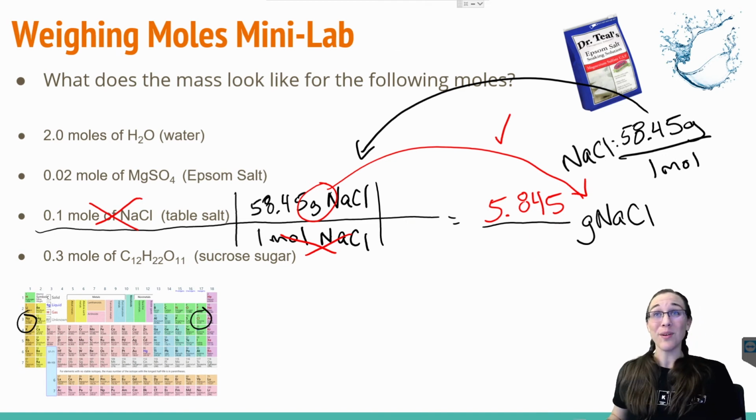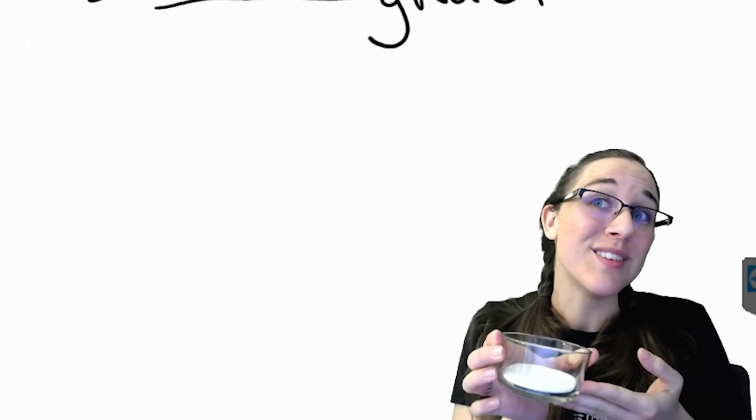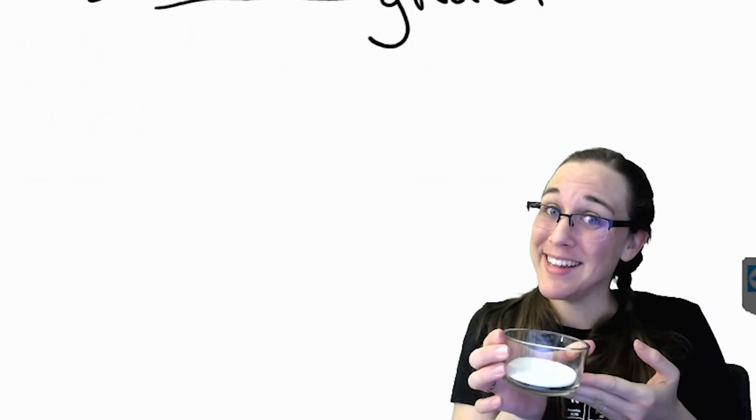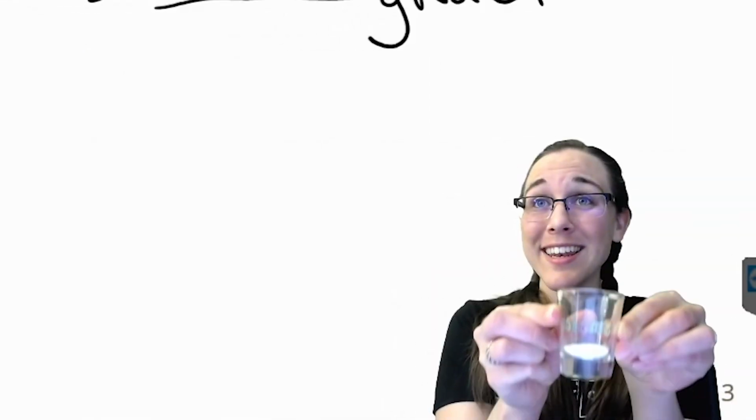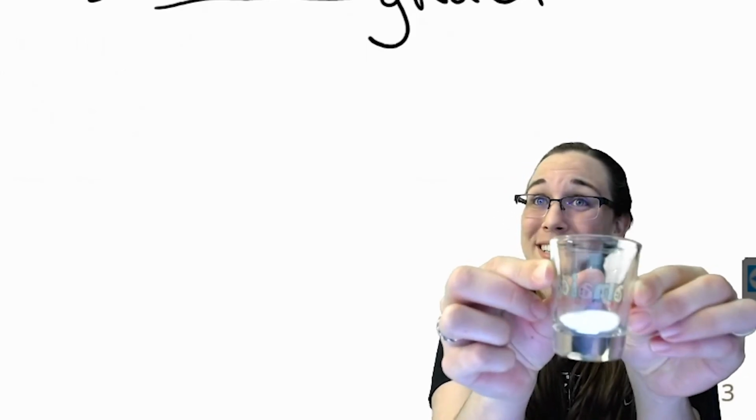I know you know what a mole of salt looks like, but what does 0.1 moles of salt look like? Well, hang tight, I'll show you. Ta-da! There's our 0.1 moles of table salt, NaCl.